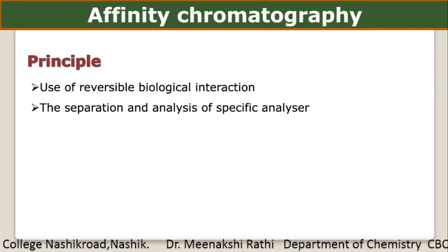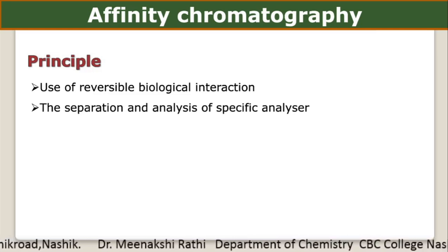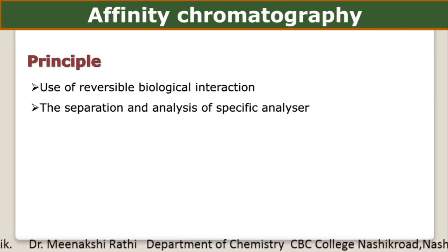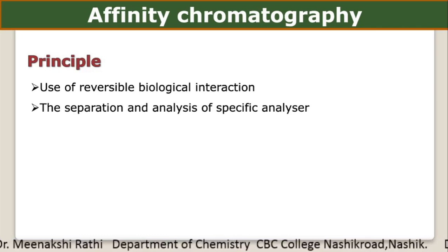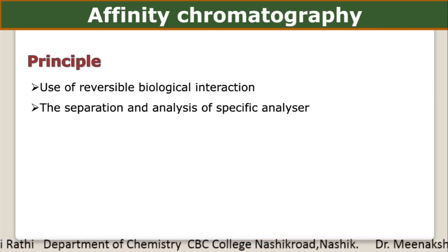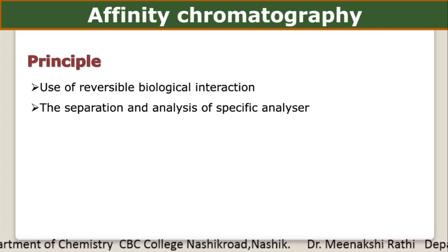Here, the separation and analysis of specific components within a sample is done by using a ligand. Here, ligands are attached to the solid matrix by covalent bond.